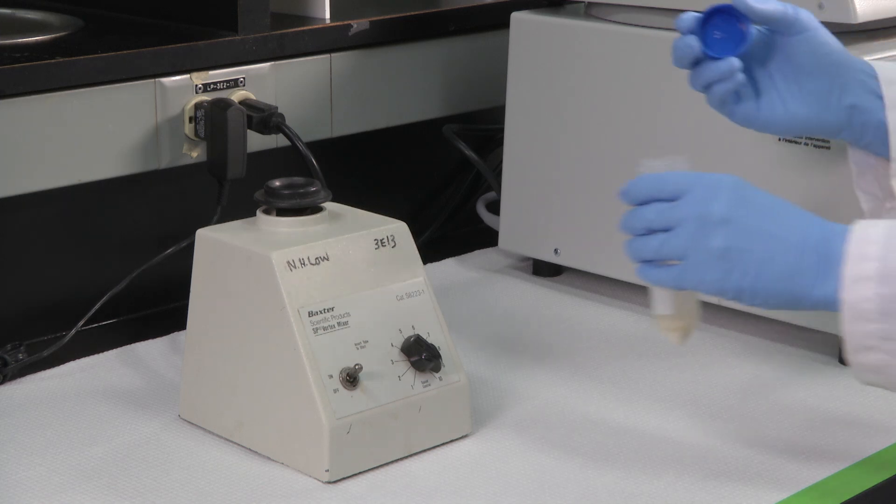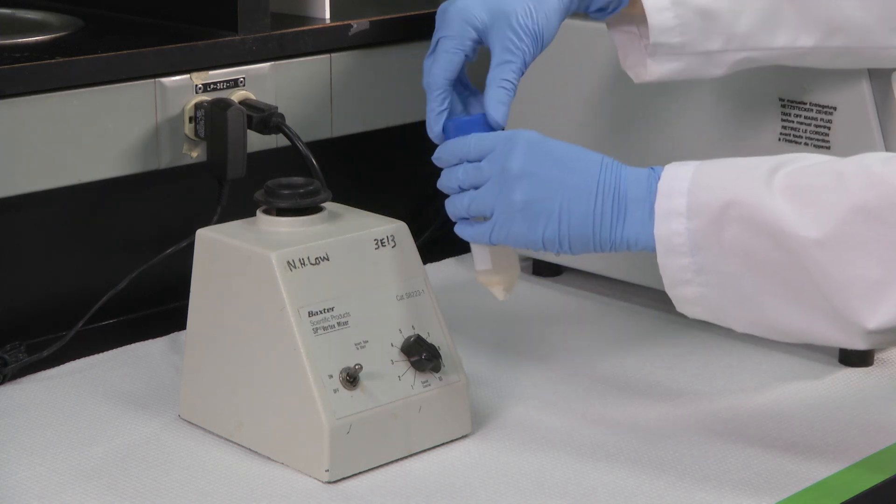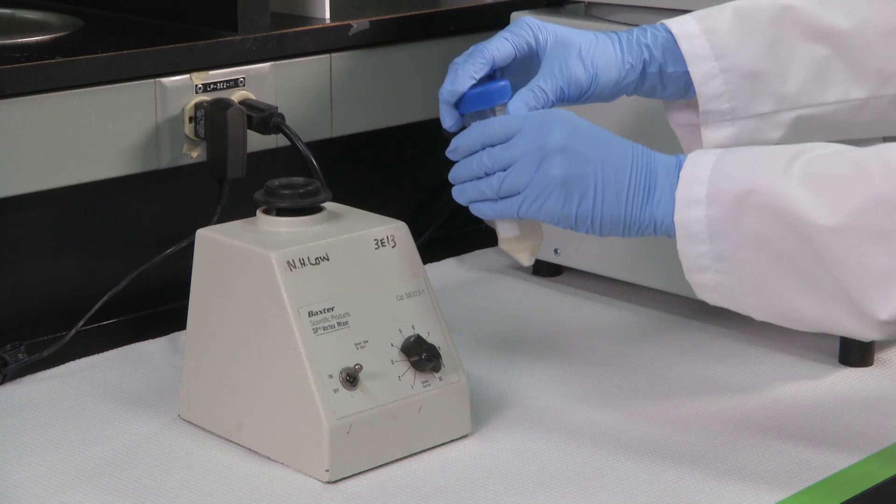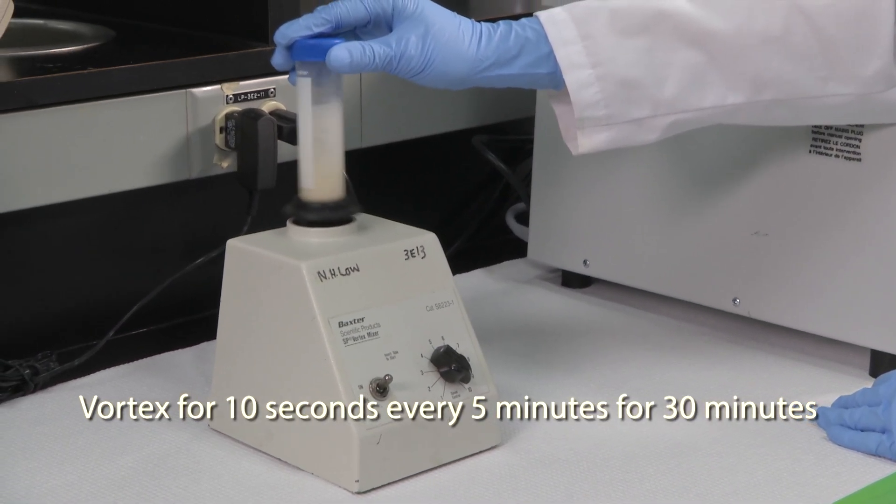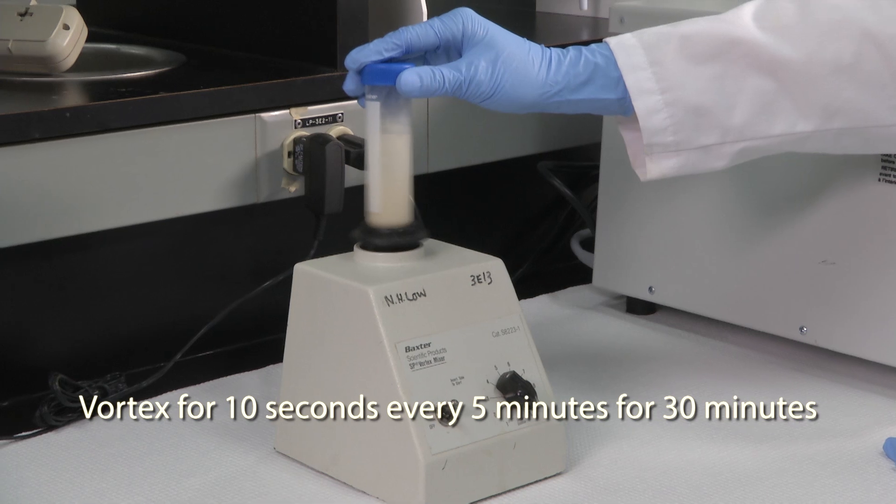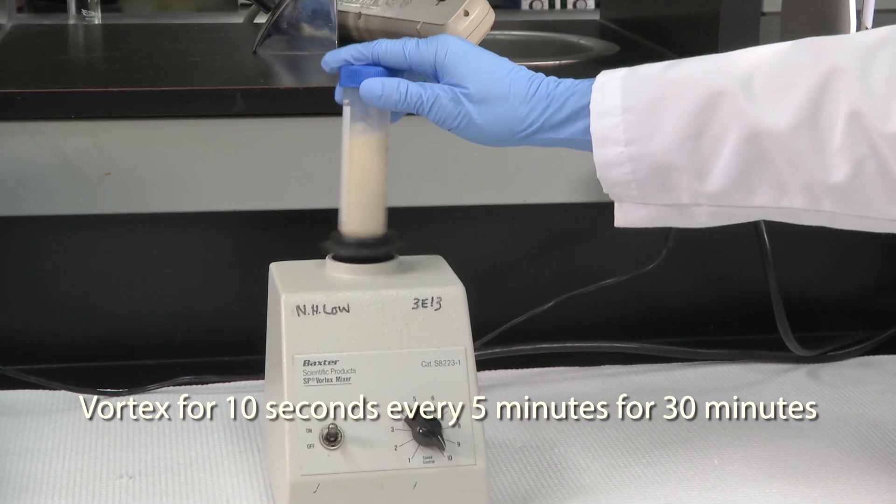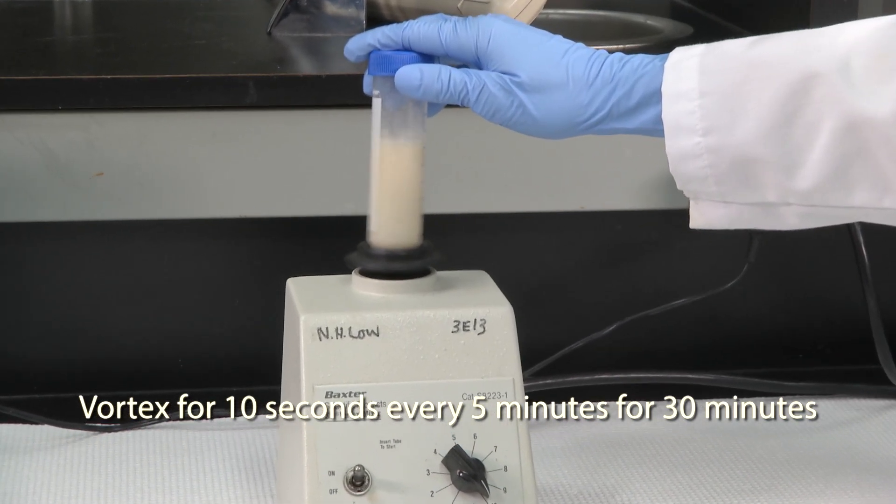Remember to put the cap on the tube before vortexing. Next, vortex the mixture for 10 seconds every 5 minutes for a 30-minute total holding time, making sure the material is thoroughly wetted.